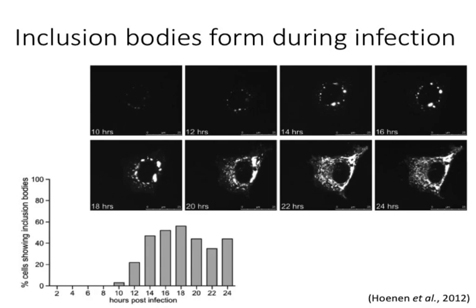So if we look at what these look like, here's some immunofluorescence. It's not in color, but we've got just shades of gray for this one. So the top here are over top and the bottom images are showing from 10 to 24 hours post-infection of 293 cells with Ebola. Where is NP localizing? And you can see that you start to observe some of these punctated dots early on at about 10 hours, but what happens from 10 to 24 hours? What observations do we make?